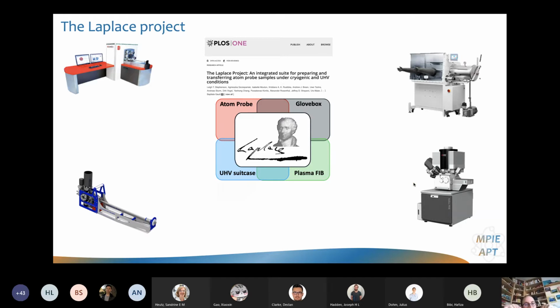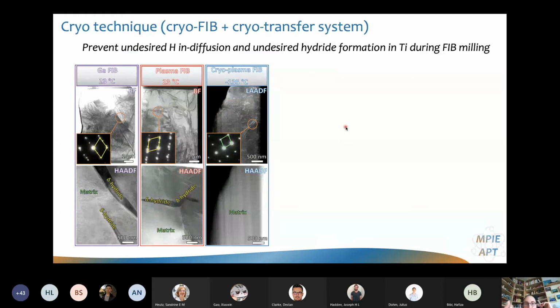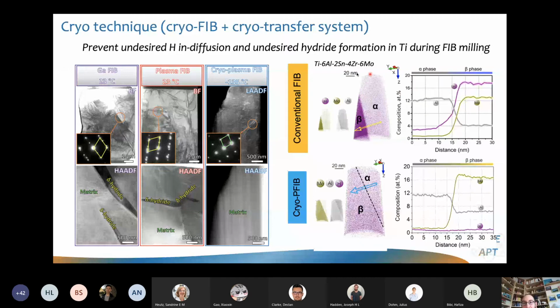And when we use our plasma FIB at low temperature, so at cryo, minus 130, minus 140 degrees Celsius, we prepare specimens and we don't find any hydrides. If we do the plasma FIB at room temperature, we find hydrides everywhere. If we do the gallium FIBbing at room temperature, as I said before, we also end up with these hydrides everywhere. So it seems that going cold is already a first step towards making things a bit cleaner. Again, in this Ti-6246 alloy, that's the type of hydrogen concentration we would typically get, about 15, 16% in beta. In the cryo case, we find zero, or more or less just the background, which comes from the microscope itself. That was already a good sign that now we are clean, and we might be able to charge or put more hydrogen inside and look where it is.